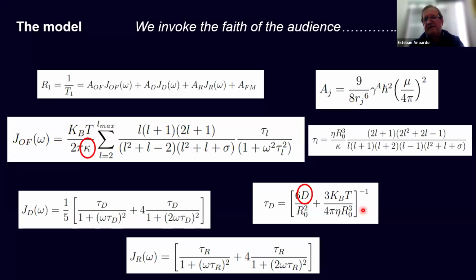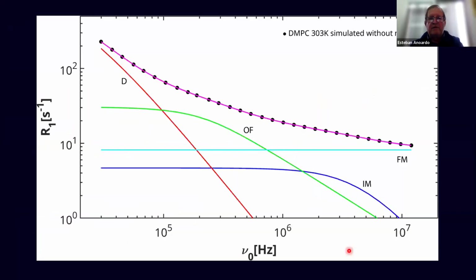This is the model. It was shown many times in the past in different talks, so just to have a look: the order fluctuations, the amplitude of different spectral densities, the relevant parameters, the interproton distance, and this is the diffusion model coming from Berkeley-Hals in a limit. Here is where we get the diffusion constant, and here is where we get the elastic bending modulus. And these are, here is R because it's taken from an old paper, but now we call this Lorentzian intramolecular motion.